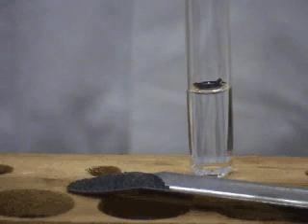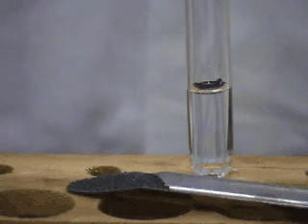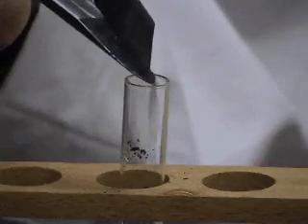Here we have a sample of pure calcium metal and water. Record your observations before we mix them. Here the calcium has been added to the water. Record your observations.